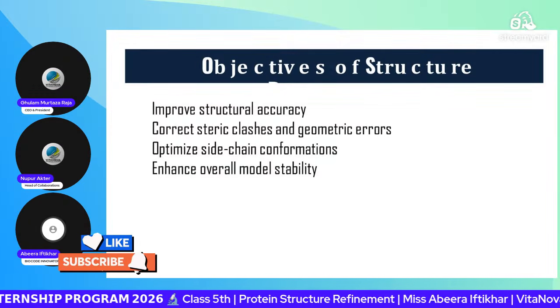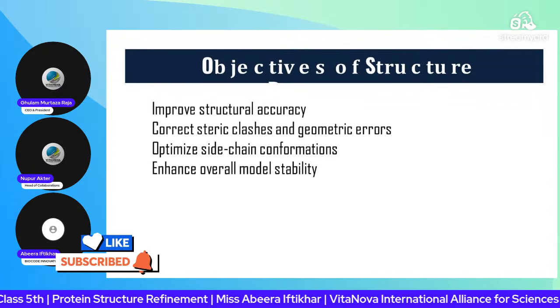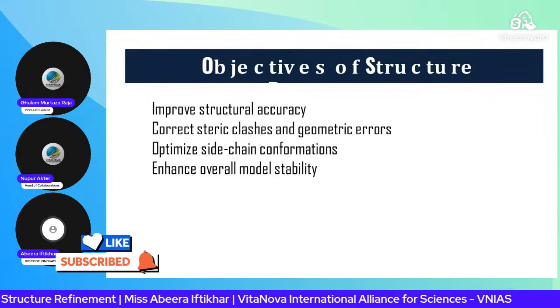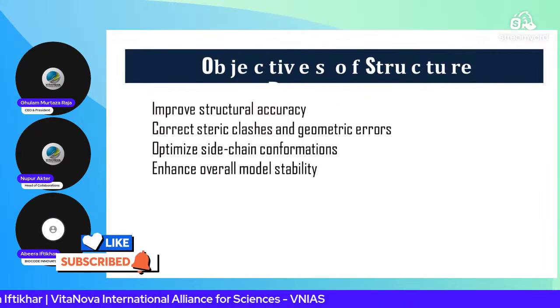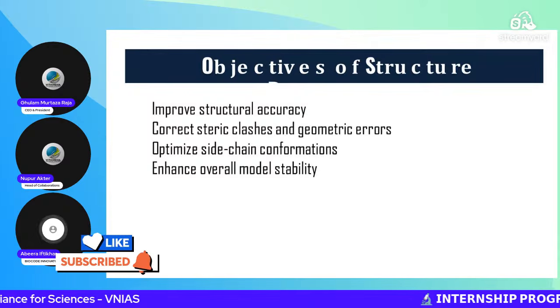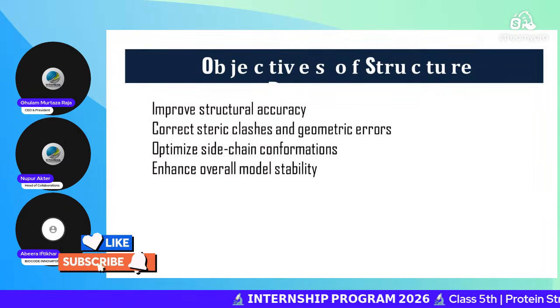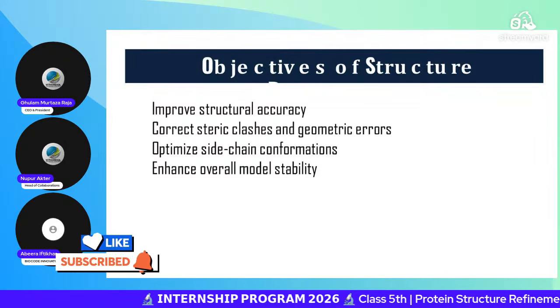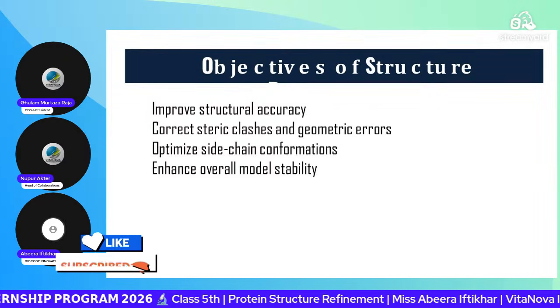If the 3D structure isn't available, we have to predict it using different tools and software. And if the 3D structure of the protein is available, but the resolution isn't good, or isn't falling into the range that is considered good, we have to move toward refinement of that structure, so that afterwards we can move for any kind of downstream analysis.